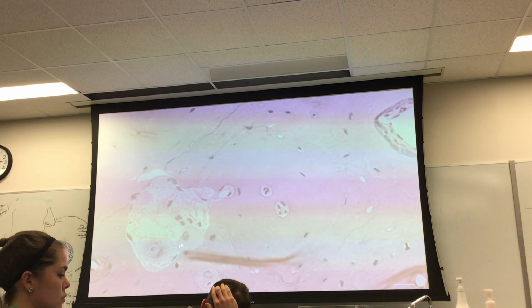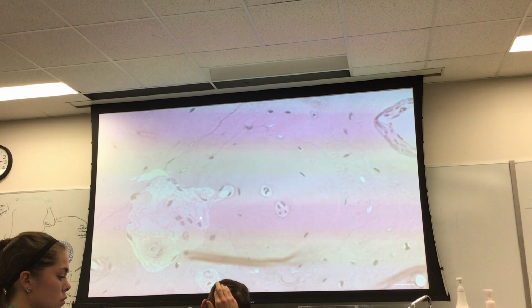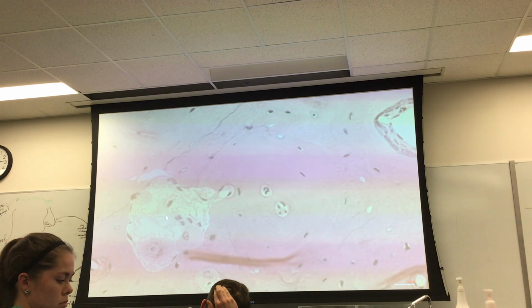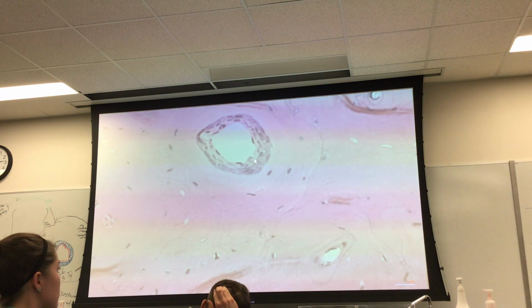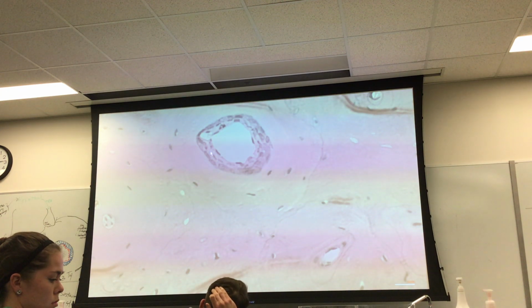These cells are called osteoclasts. In this case, it's not going to really be lined by osteoblasts, and that's why you know this is a resorption canal. As opposed to this, the one right here, where you'll notice that the cells now lining this bone surface, these are now an intact layer of osteoblasts.